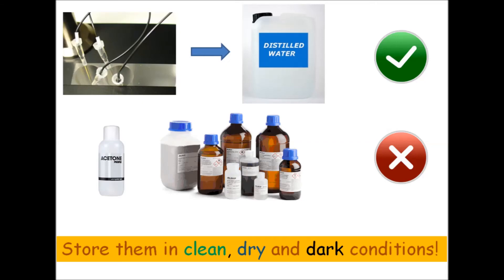The electrodes must be rinsed with distilled water. Acetone or other strong solvents should not be used. Bare electrodes should be stored in a clean, dry, and dark container.